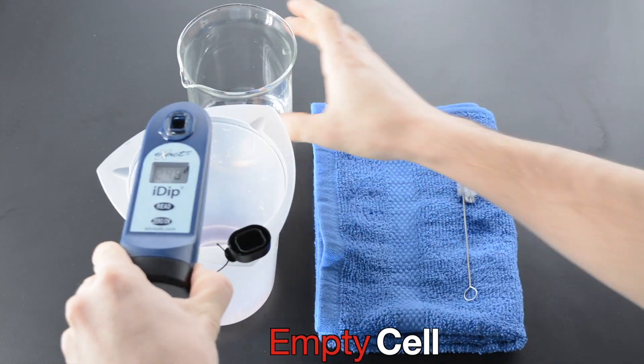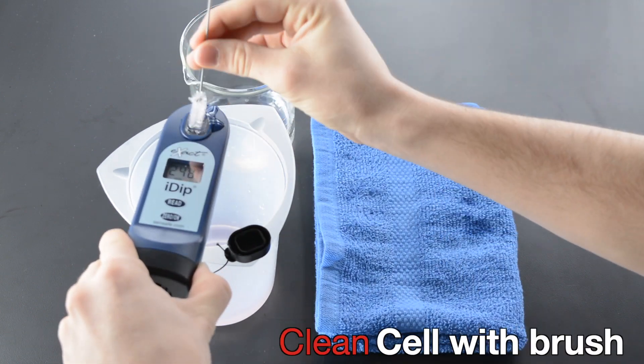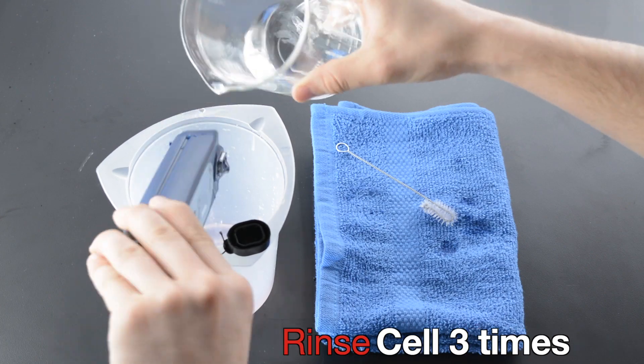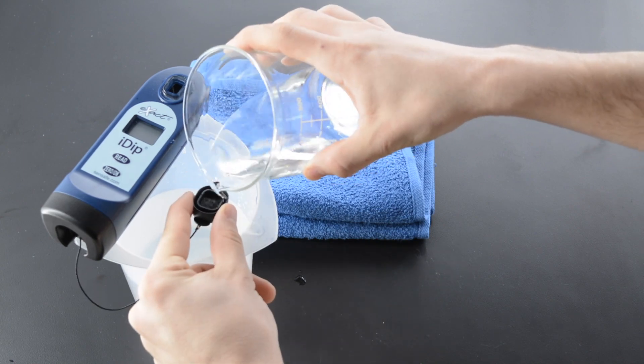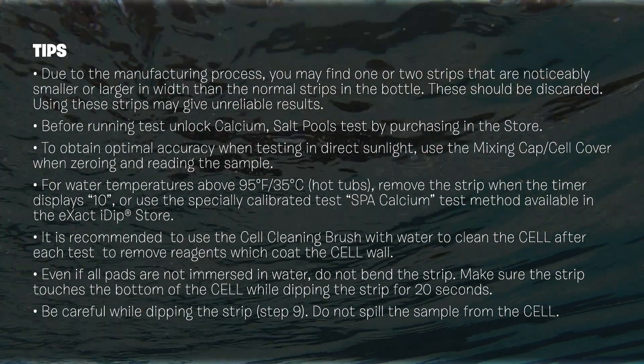Empty cell. Clean cell with brush. Rinse cell three times. Rinse cap three times. Take a look at the table. Drain.